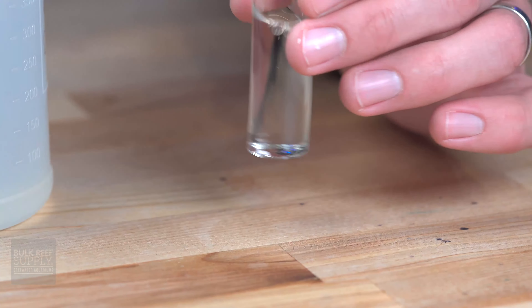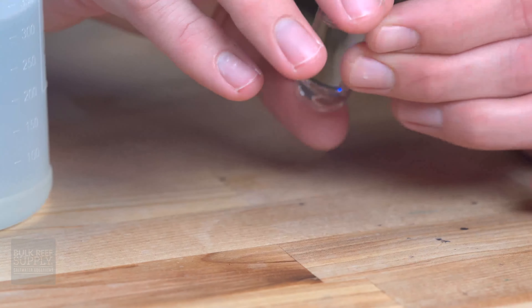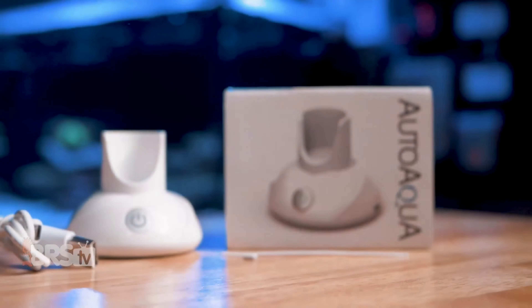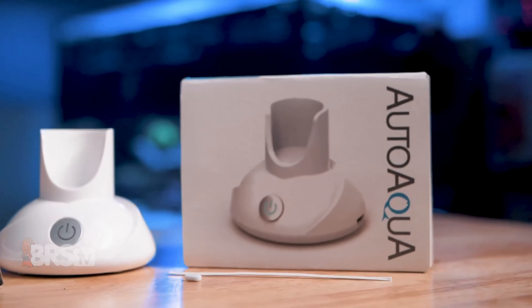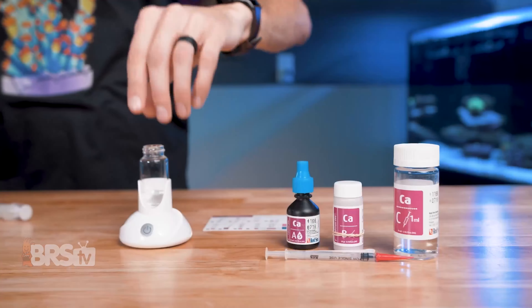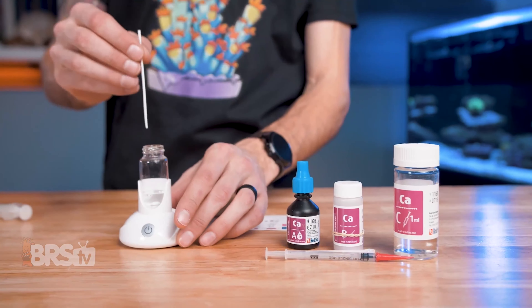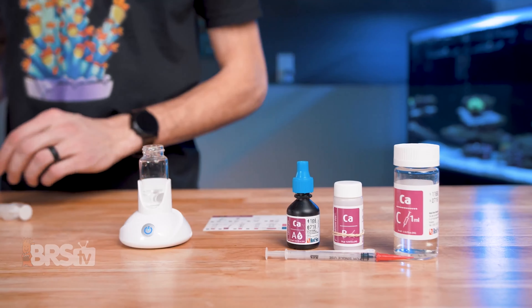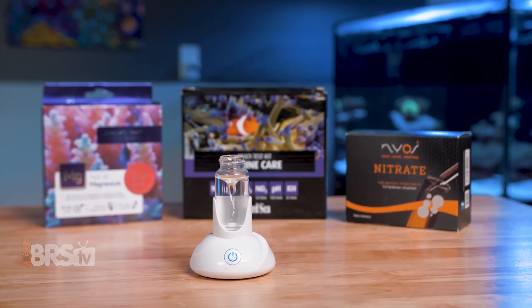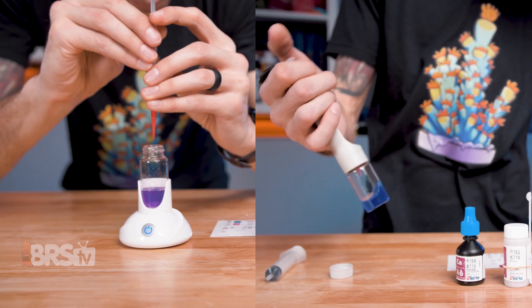A couple quick tips: make sure to rinse your cuvettes after you're done with fresh RODI water. This kit also pairs really well with the Smart Stirrer from Auto Aqua — you might remember something similar from high school chemistry class, it's basically a magnetic stirrer. This will prevent you from having to wiggle the cuvette around manually and lets the machine do the work so you can see those color changes a little bit easier.